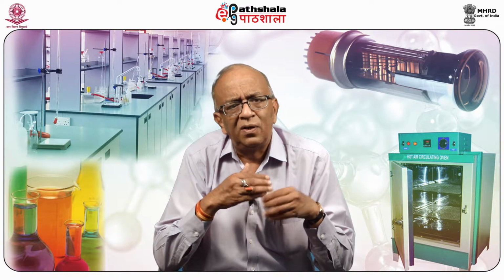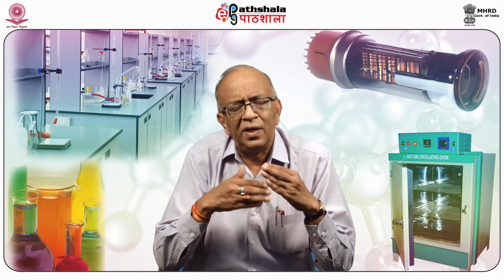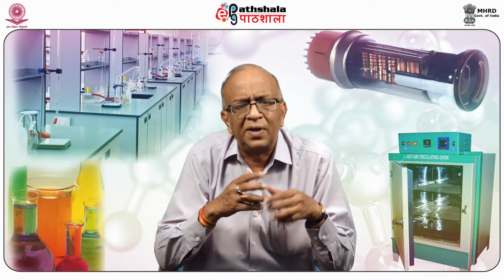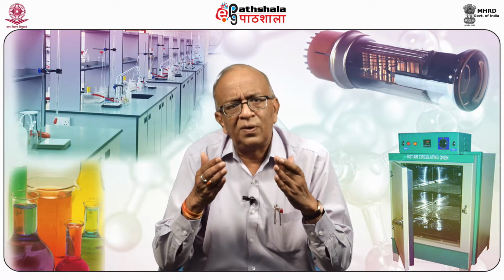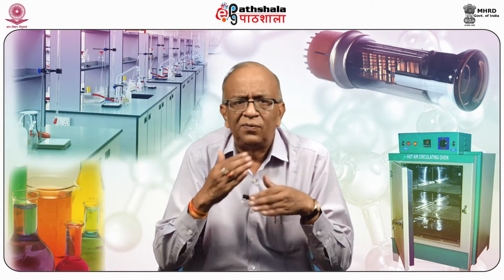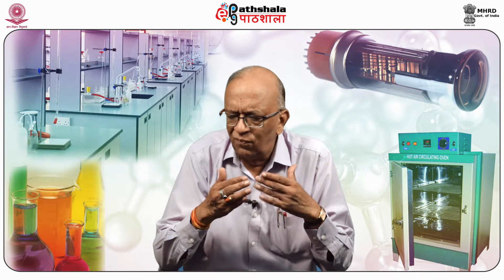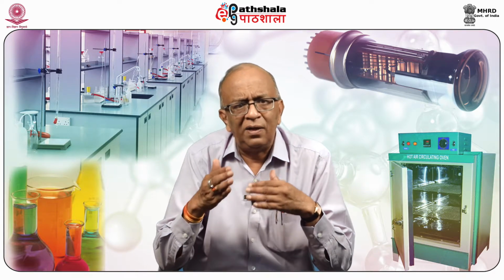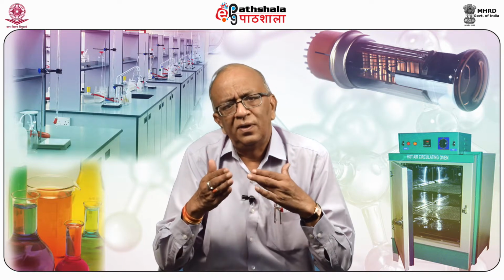Another type of technique which has been developed is dynamic reflectance spectroscopy. Here a spectrophotometer is used for the measurement. Next technique is evolved gas detection. Whatever gas is evolved, that is measured. Evolved gas detection, represented as EGD. The measurement device is the thermal conductivity cell, and based upon that measurement, evolved gas detection is made.